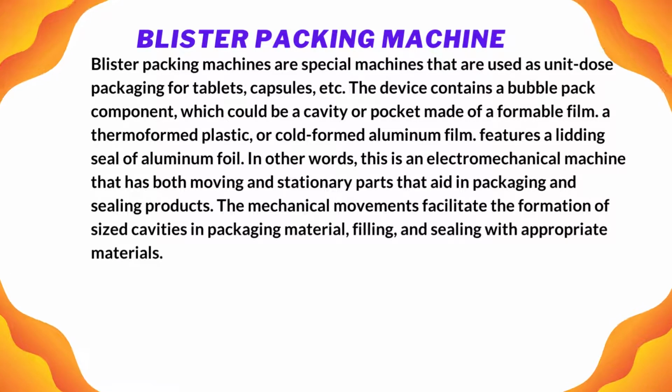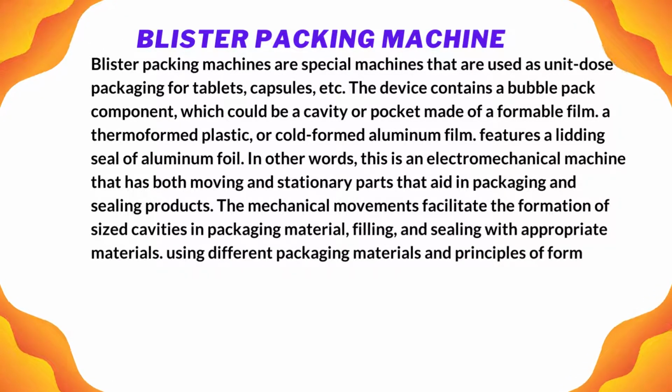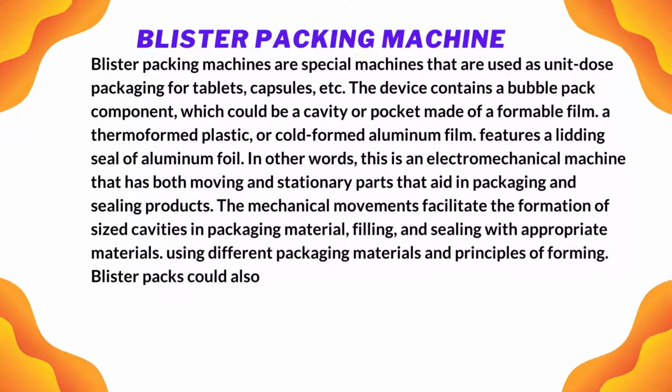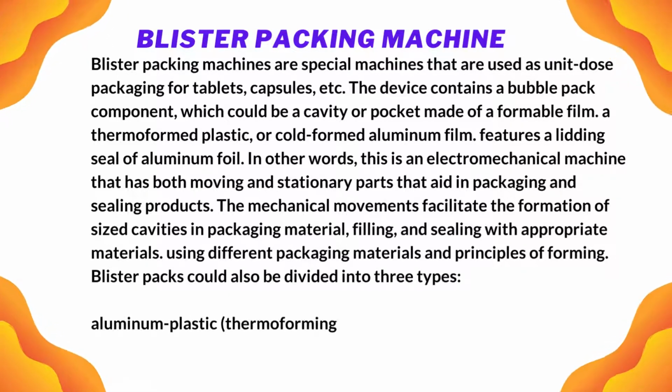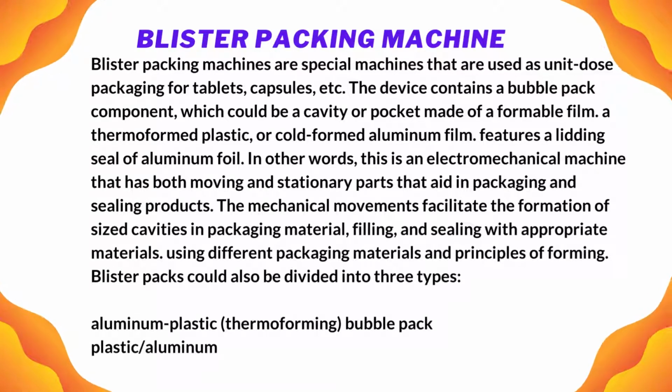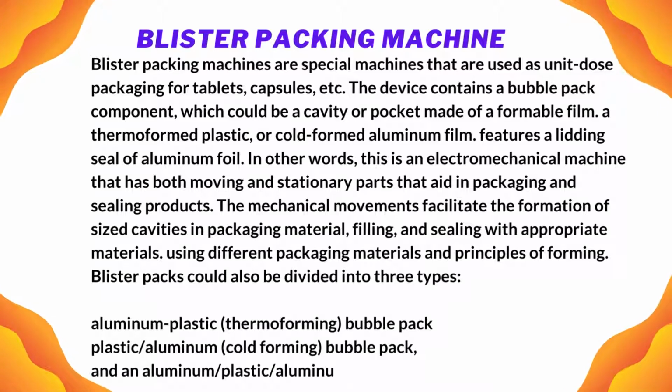Using different packaging materials and principles of forming, blister packs could also be divided into three types: aluminum plastic thermoforming bubble pack, plastic aluminum cold forming bubble pack, and an aluminum/plastic/aluminum bubble pack.